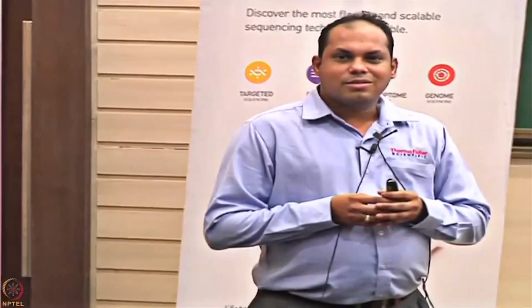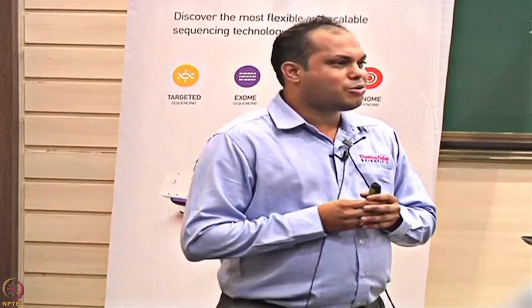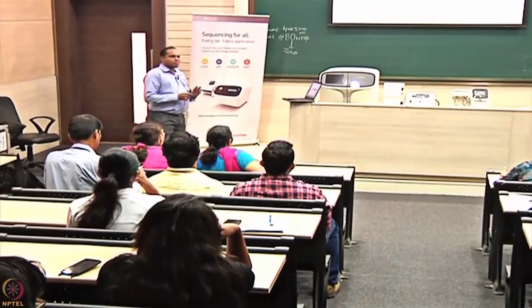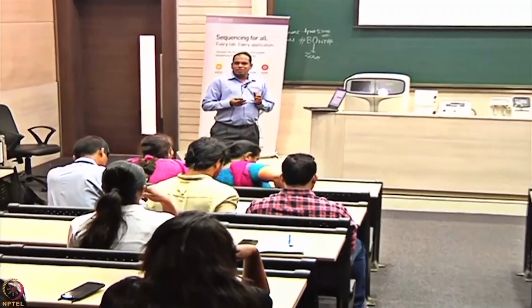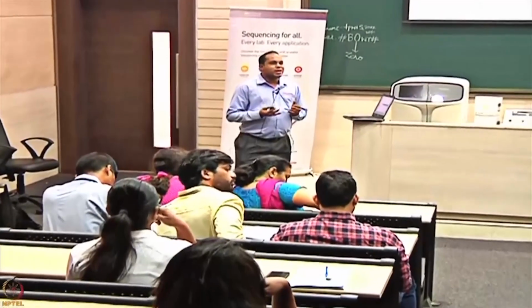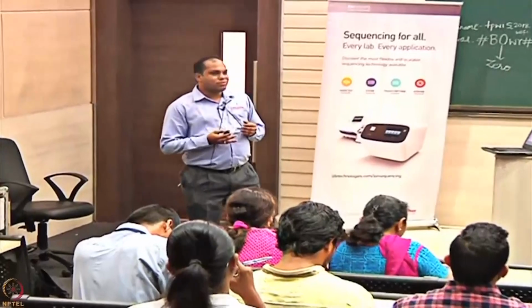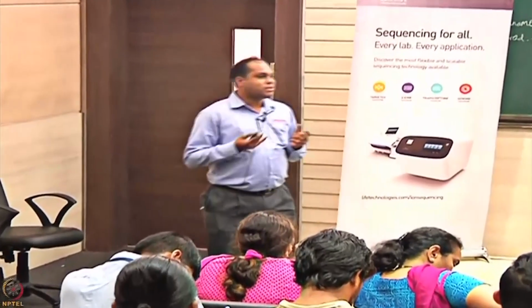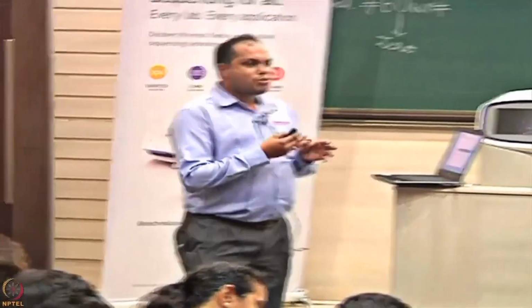Good morning everyone. So, you must have gone yesterday through the ion torrent technology, right? You have seen about sequencing yesterday, so you have got an idea of how the system works. It's about signals, it's about recording the data in few minutes within seconds, and then you're going forward with sequencing and recognizing which are the bases that are getting generated, right? So, you have seen lots of steps in doing sequencing.